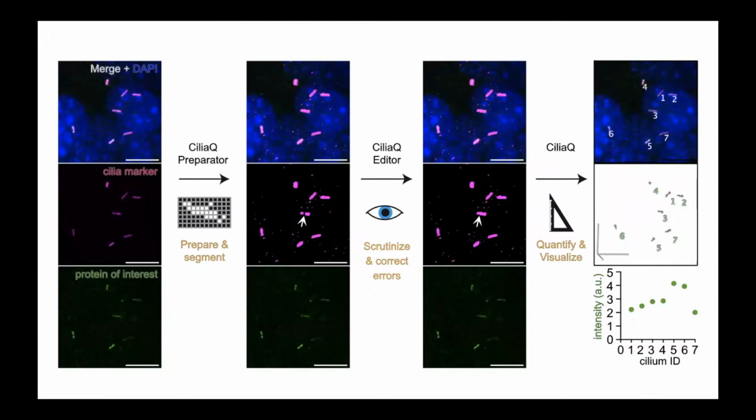If you remember, we've been through CiliaQ Preparator and CiliaQ Editor, and now it's time to explore CiliaQ and get to know how it works and what we can do with it. As a general point, if you remember, I mentioned in the general introductory tutorials that CiliaQ can reconstruct the ciliary object based on the image, which is processed with CiliaQ Preparator and Editor, and then quantifies cilia and visualizes the results. Now, before any explanation, let's go back to Fiji and open up CiliaQ.